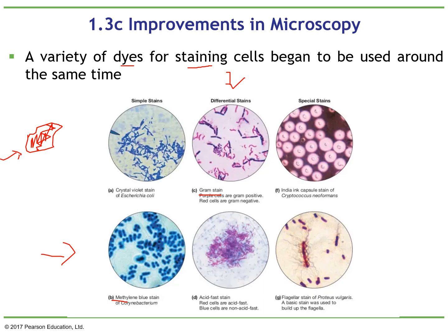Or we can create a staining for a specific protein that is in the membrane, so we stain only this area of the cell. We can see in the lab, for example, stainings where only here in green is the nucleus, or we can have stainings for the actin. So it's a very useful tool.